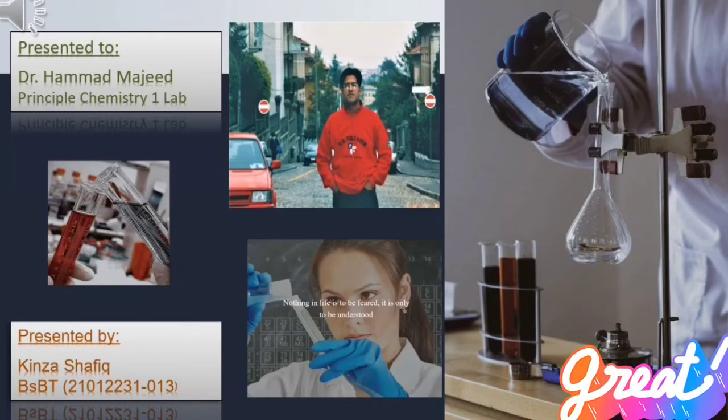Myself, Kinza Shafiq, and today the topic we are going to discuss is how to make a solution.